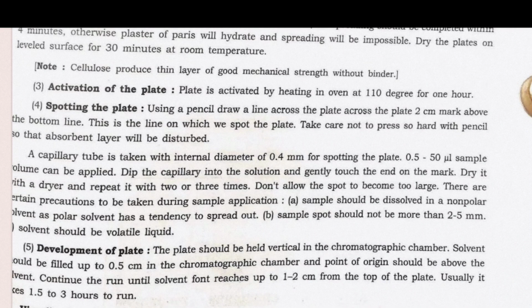There are certain precautions to be taken during sample application. First, the sample should be dissolved in a non-polar solvent, as polar solvent has a tendency to spread out. Second, the sample spot should not be more than 2 to 5 mm. Solvent should be a volatile liquid.